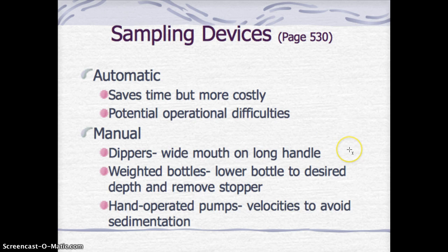Manual. Dippers are used. Basically it's a wide mouth on a long handle, so in case you're reaching over a bridge or over a pond or a reservoir, you can just hang over the edge and dip in.